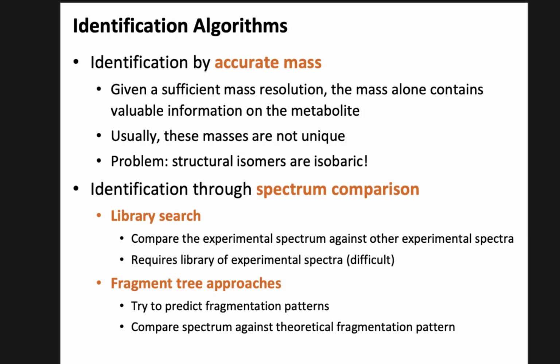Yeah. We've done that in one case. We got the spectrum. The spectrum was correct. We thought we had identified it. So we spiked it in the original sample, and the peak showed up at a completely different retention time. So, you know, these things can happen. Most reviewers will be happy if you show them the spectrum of your reference compound and say, look, this is the exact same spectrum, but you have to run it on the same instrument as well, under the same conditions. That can cause issues as well.